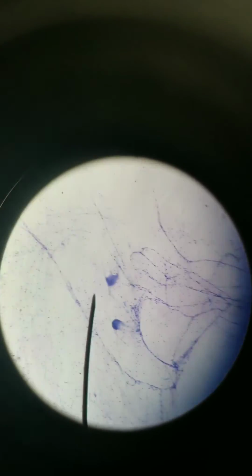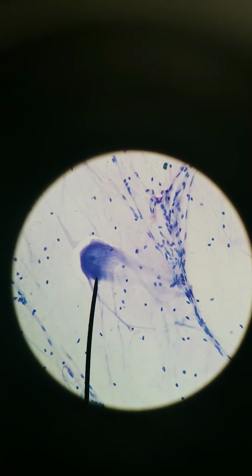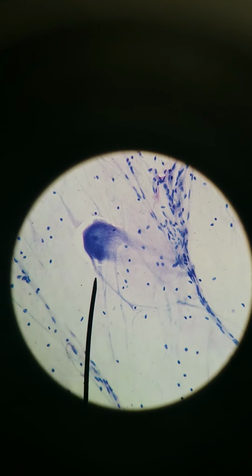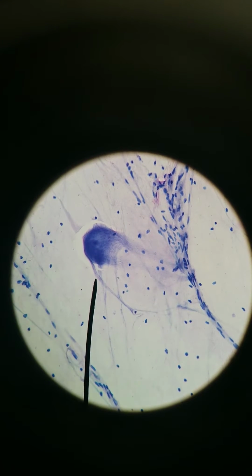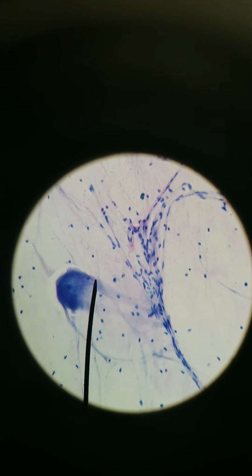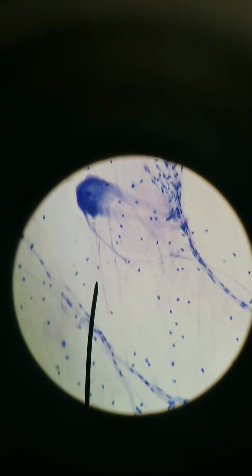So we're at 100x now. Let's switch to 400x. What happened? There we go. 400x. Great. We can see our neuron cell body. Another word for the cell body is the soma. We can see the nucleus inside of the cell body. And then we see a bunch of extensions coming off of it. Like here's an extension. Here's an extension. There's an extension. There's an extension. So these extensions are either dendrites or axons.